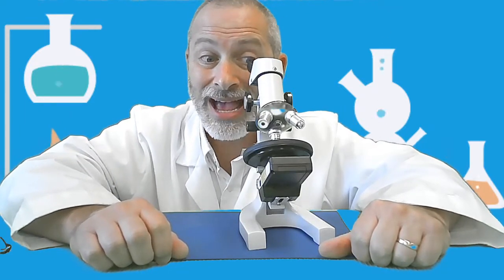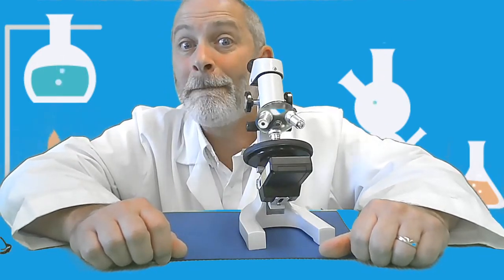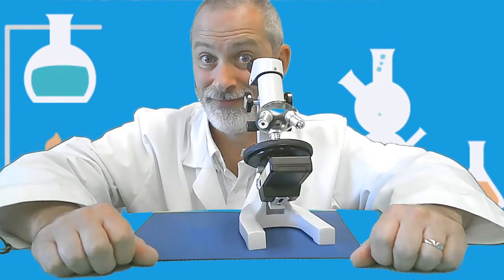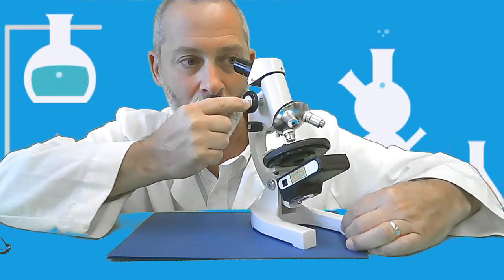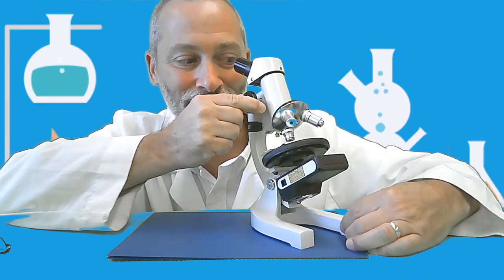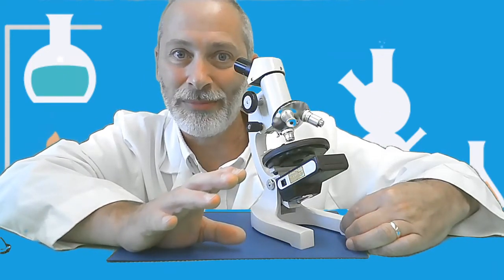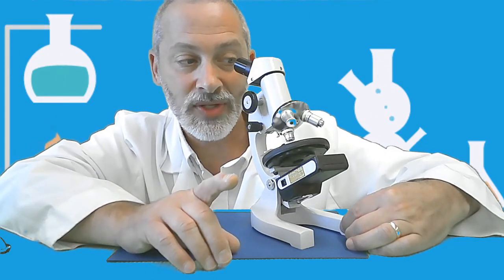All right, right now I'm looking into my microscope, and all I see is nothing but a big white circle. That's because I haven't focused it yet. So what you need to do, starting with the coarse adjustment knob while looking into the microscope, is slowly move the coarse adjustment knob until you start seeing an image in focus, which I do now. And I only moved it a little bit, but I now see an image in focus.